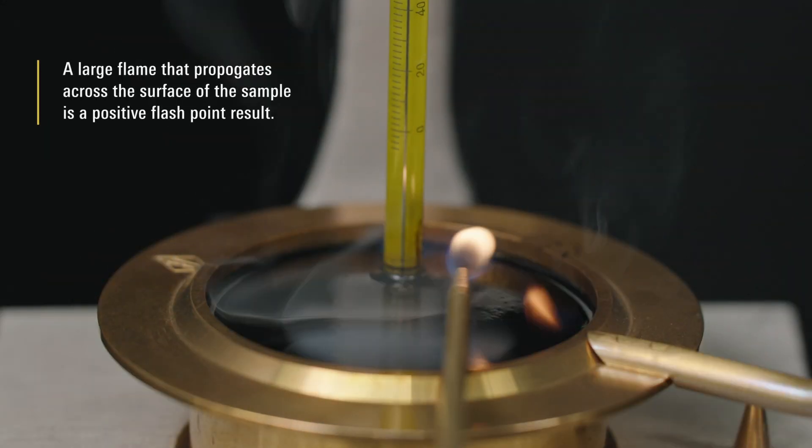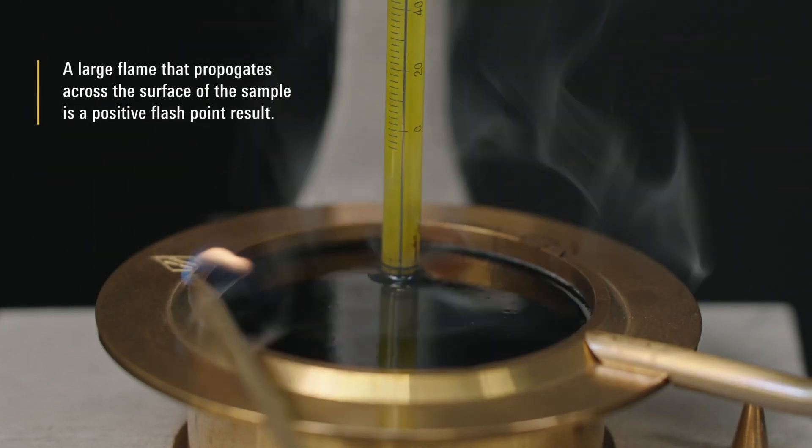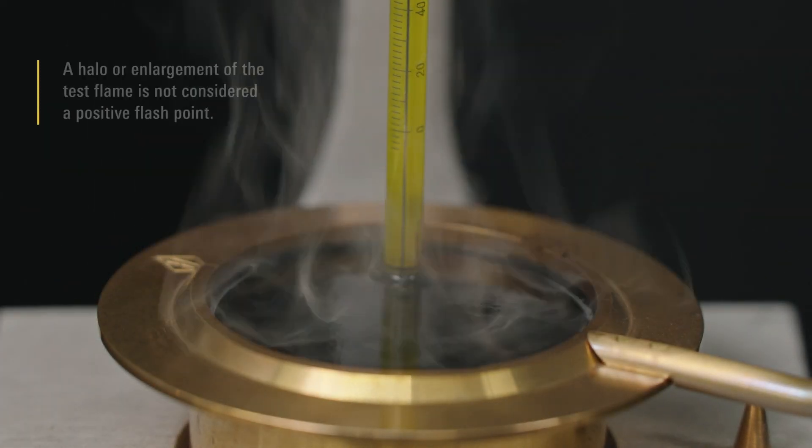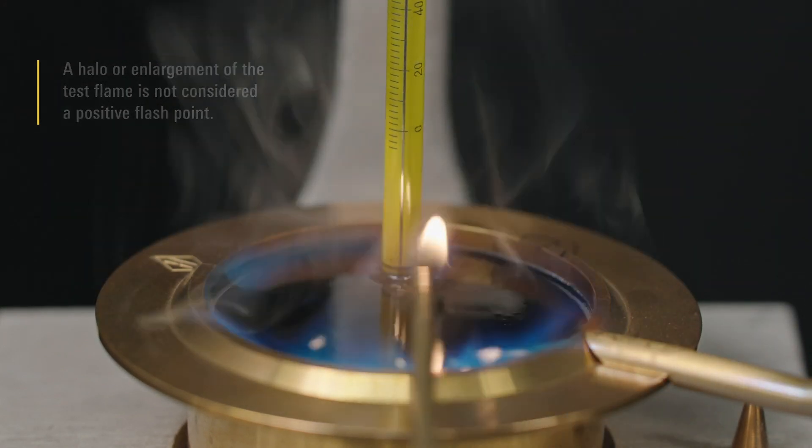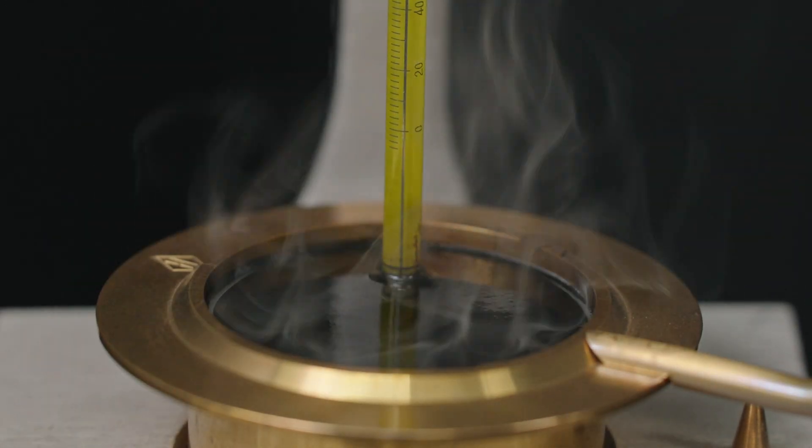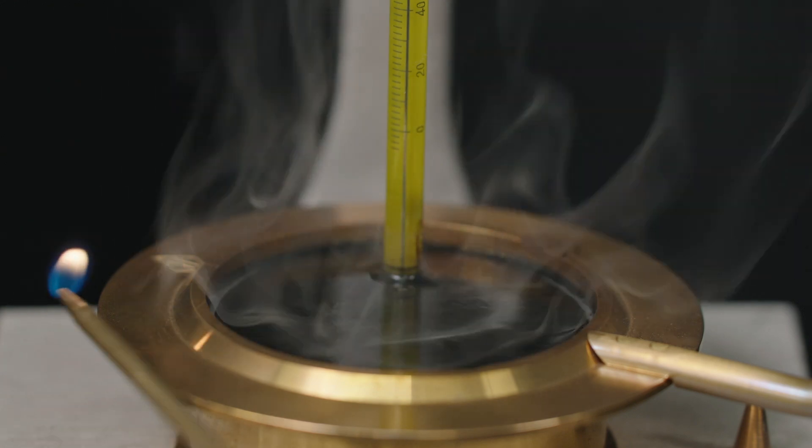A large flame that propagates across the surface of the sample is a positive flash point result. A halo or enlargement of the test flame is not considered a positive flash point. Continue to apply the test flame until the large flame is observed.